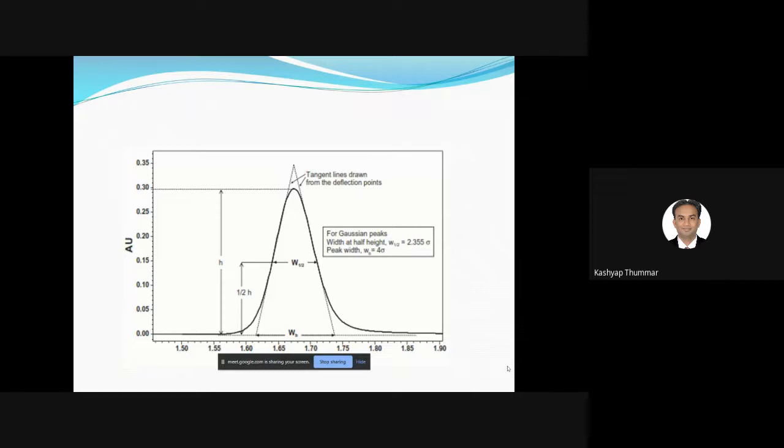Okay, here there are so many terms again. What is WB at the end in the chromatogram? It means peak width at base: W means width and B means base. H is called the peak height. So these are all the terminology we can call A, B, C, D. One is the retention time, another is the hold up time, third is the peak height, fourth is the peak width at base, and sixth is the peak width at half height.